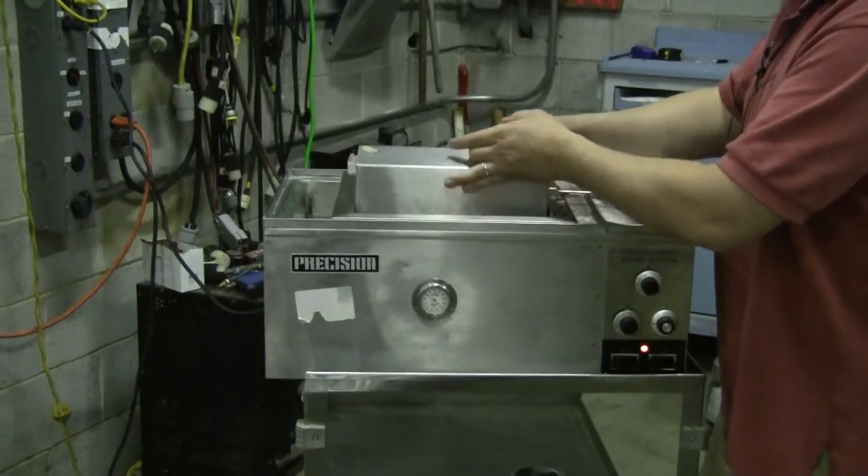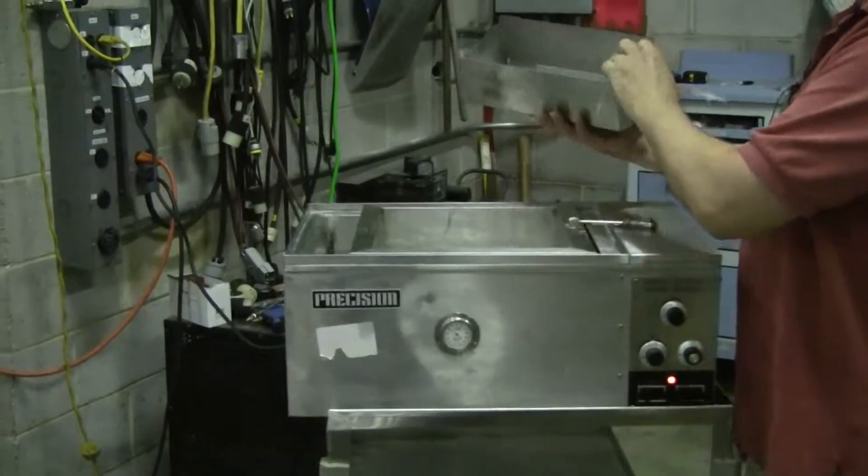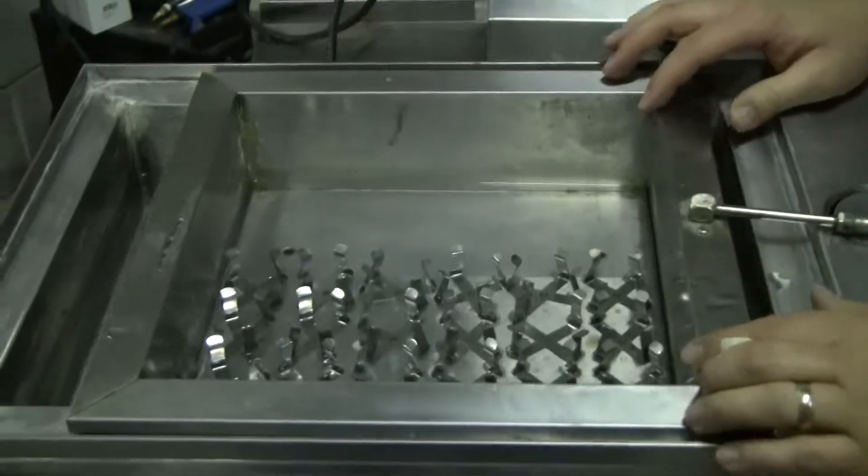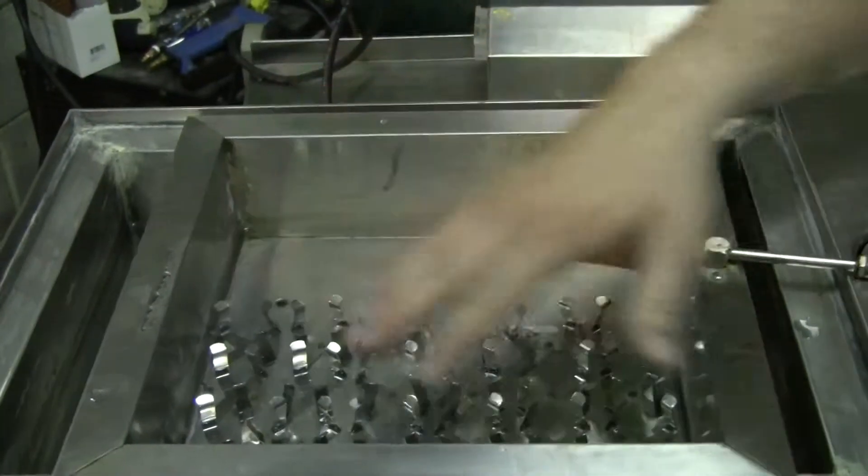Take this top off, let's take a look inside. Shallow form, it's not very deep at all — 12 inches by 12 inches.